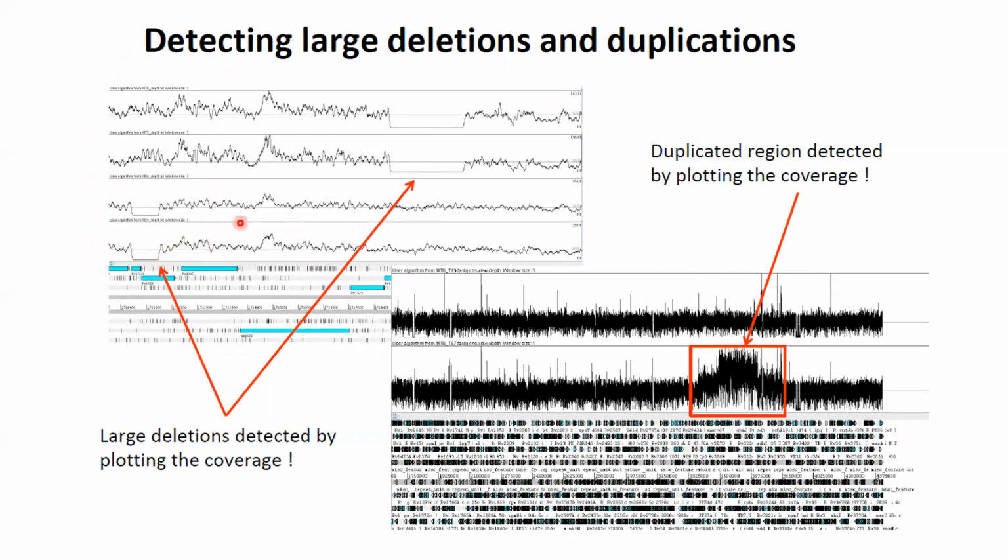You see that some genomes have very low coverage for some regions, like these two here, or like these two here, indicating that these genes, which you see here in blue, which are in our reference genome, are most likely deleted from these two genomes which we have sequenced, but not from these ones. You see there are plenty of reads aligning to those two genes.